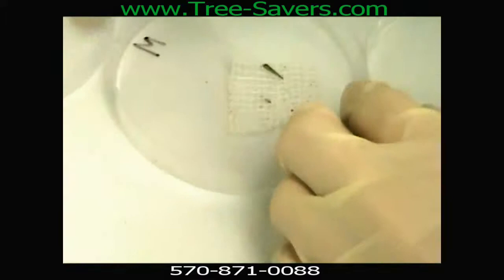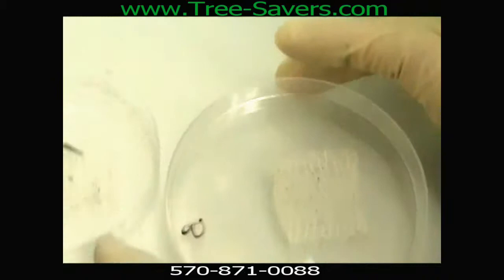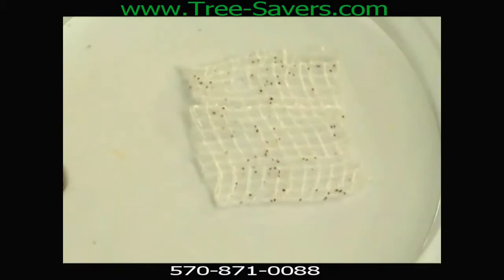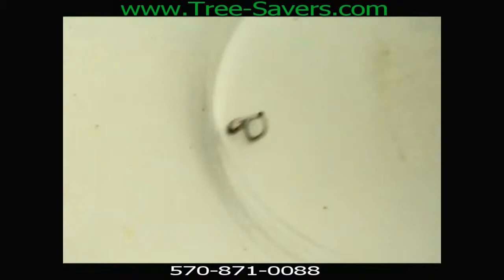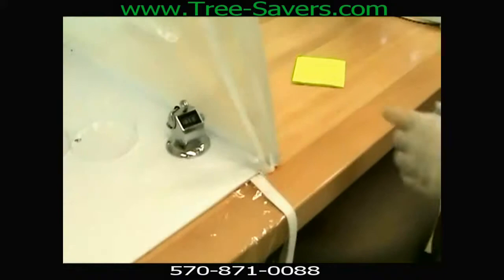These are the eggs and as I said before I labeled them — top, middle, and bottom. We do that so that if we have too many eggs, we can narrow down how many we put in a rearing cage. All of those little red dots are beetle eggs, and if my estimation is correct, that's between 100 and 125 eggs — it could even be more. This is going to be a very good jar; we're probably going to hit about 400 eggs total.